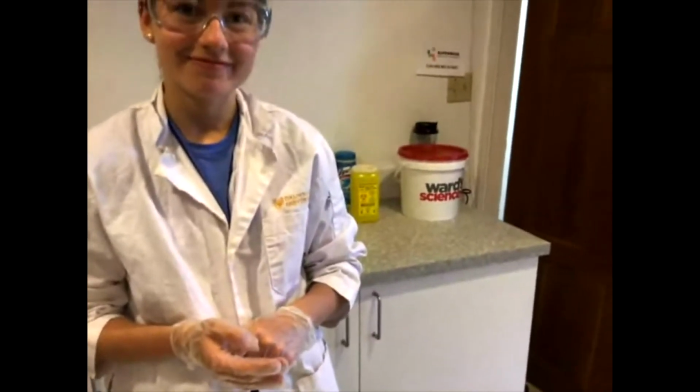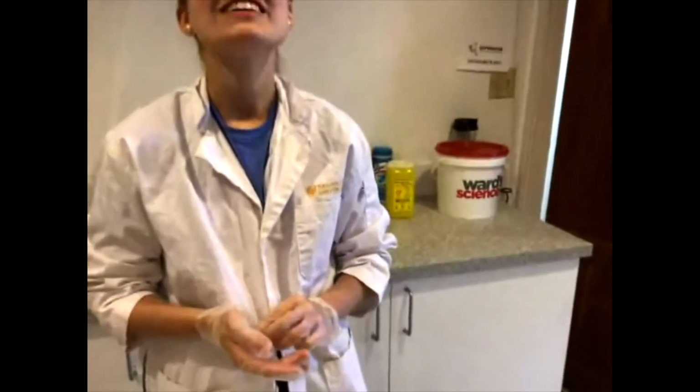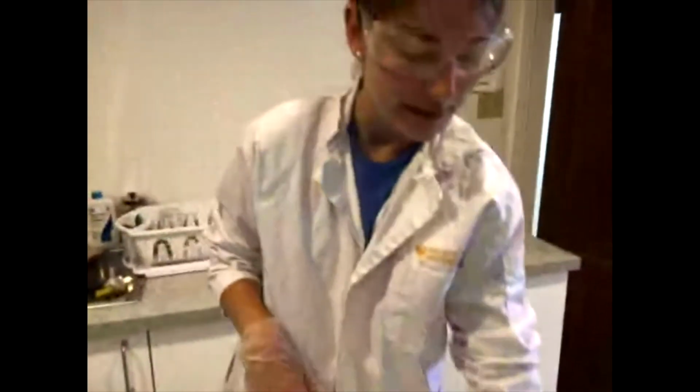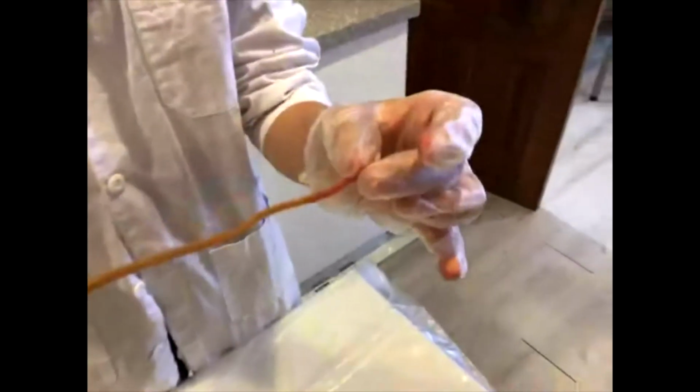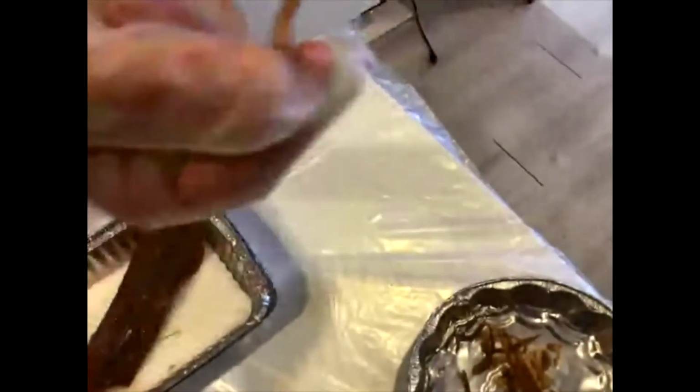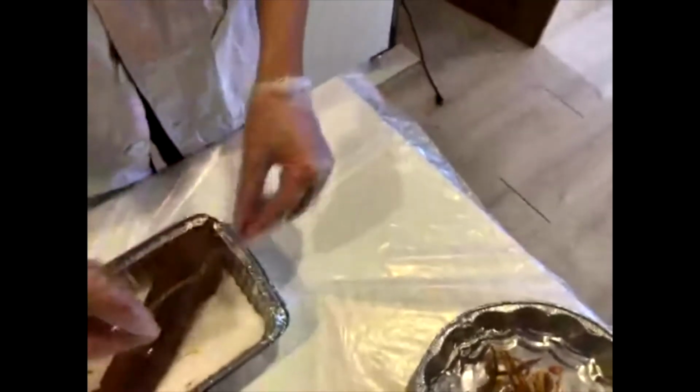And Benjamin said, don't some squids have arms with hooks on them? I read about this. Yes, they do. A few squids don't have hooks on their arms, but they have them on their tentacles. So this here is a tentacle, and the hooks would just be at the end here where it has those little suckers. Can you see those little round discs? That's its suckers. It helps them grab onto prey, and then they would have a hook just on the end there. This guy doesn't. Some species do, some don't, and it depends on their size as well.